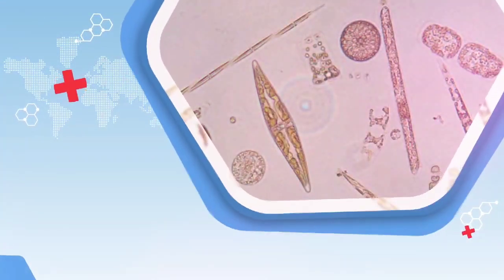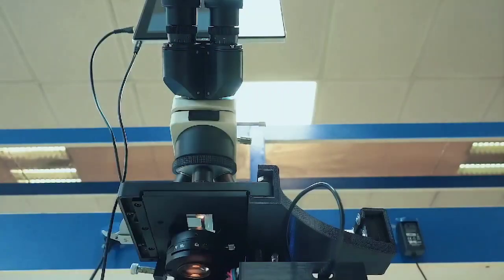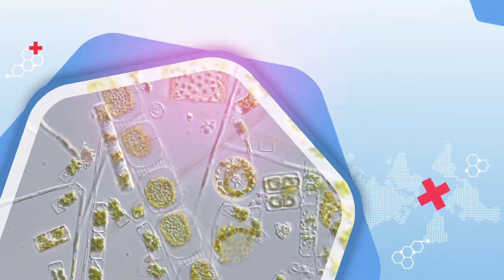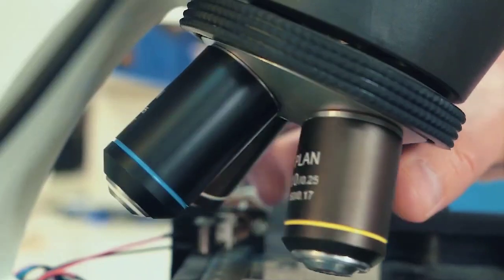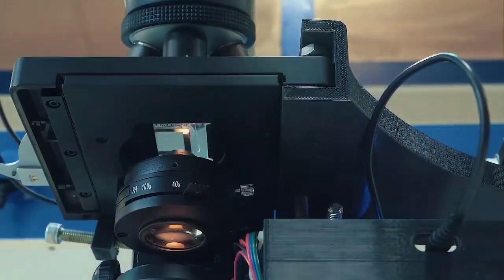Subsequently, the AI model analyzes the collected images to identify potential microorganisms. With the integration of deep learning and image processing techniques, MicroID has the capability to detect harmful phytoplankton and zooplankton within a size range of 20 micrometers to 1 millimeter. It also provides a wide range of reports and alerts.